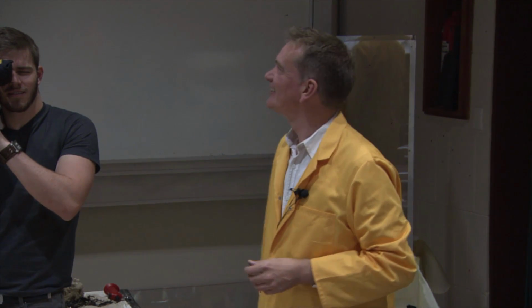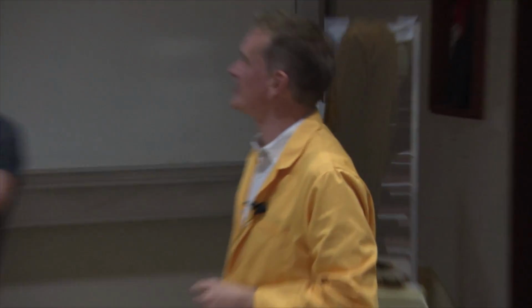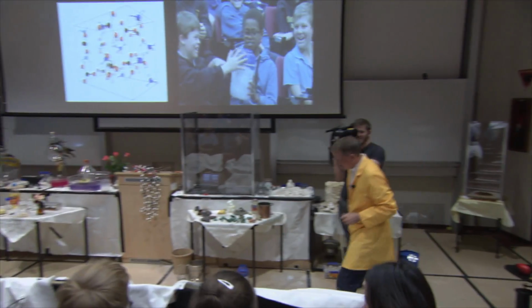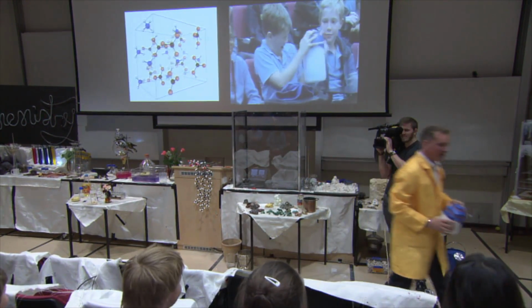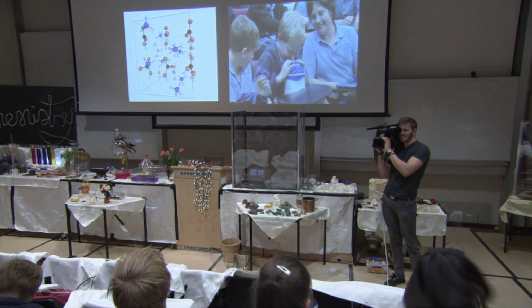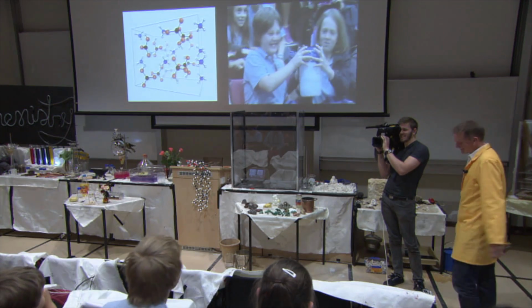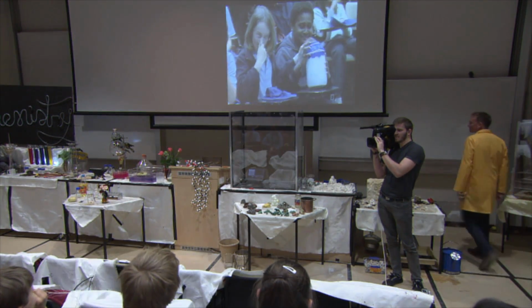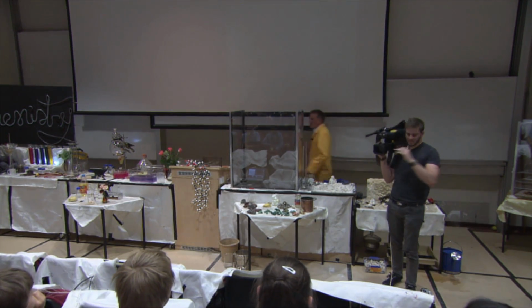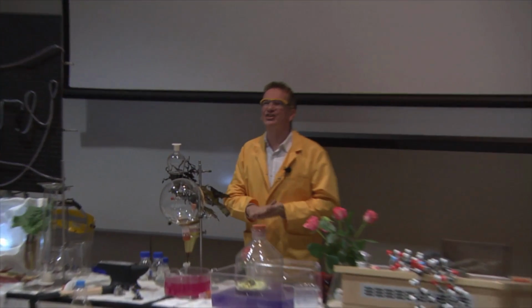Did you smell it there? Oh, you've got to try it, you know what you're missing. Okay, we also have another one. We'll pass this one round over the sides here, so if you just want to try that one. Okay, so now while that's going round, I'll show you some more reactions of ammonia.